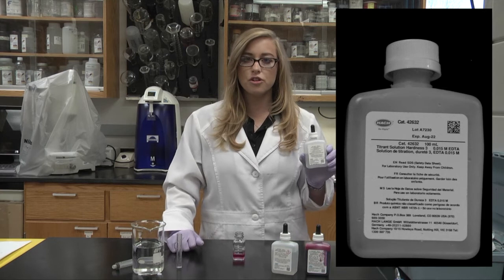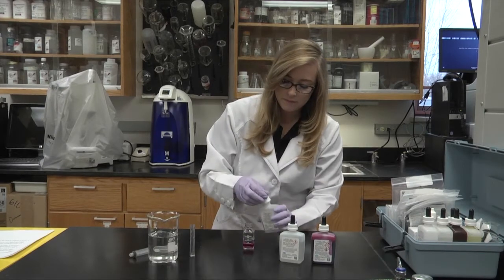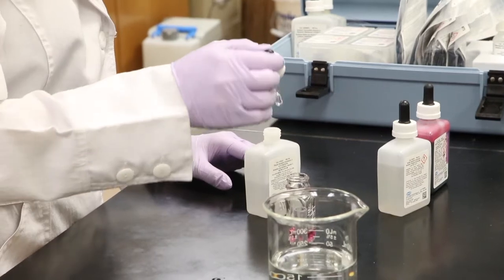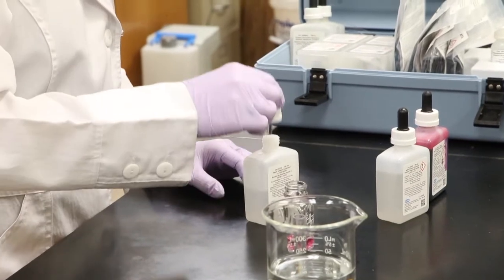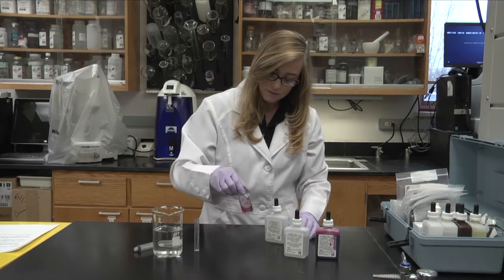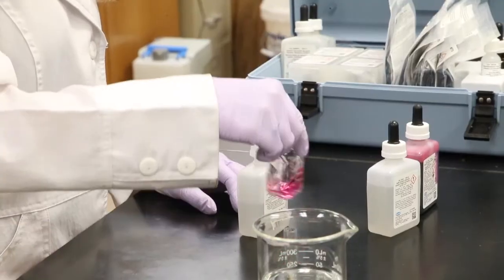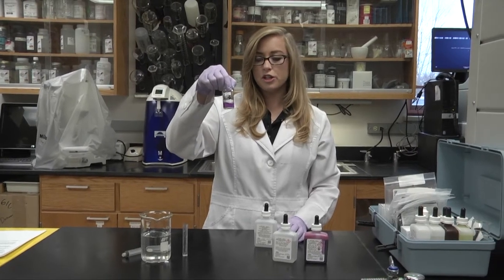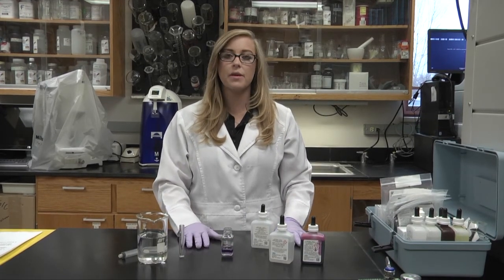Now we add the titrant reagent, hardness three, and we'll count drop by drop until we get a color change. That was 15 drops — it changed from pink to blue. To get your hardness in milligrams per liter, you multiply that by 17.1.